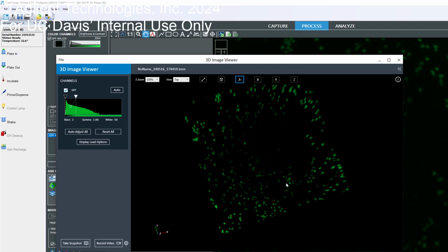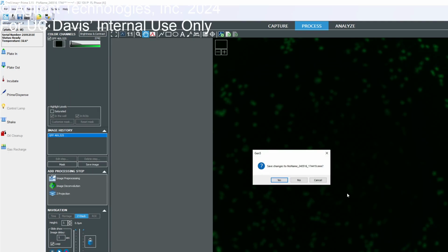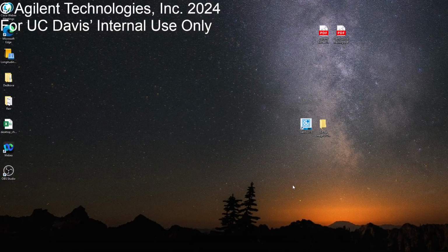Alright, yeah, thank you. Perfect. That's so fun. Chase, do you wanna open up one of your protocols? I can show you the beacon. Or you can also, I mean, is it okay if she does? Okay, I'll just show that. Just guide me because I don't know. Can I close everything? Yeah, you can close everything. Absolutely. I'm gonna need to save it. No, it's fine. Okay. Right, open up the file again.